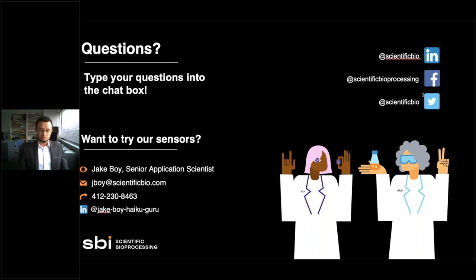What Stephen would like to do is place one sensor on each end of a rectangular culture chamber in a microfluidic system and measure oxygen before and after in the media flow through. Is this possible? Yes. I'll just take this one. Absolutely, Stephen. And the follow-up question to that is, would I need multiple readers?